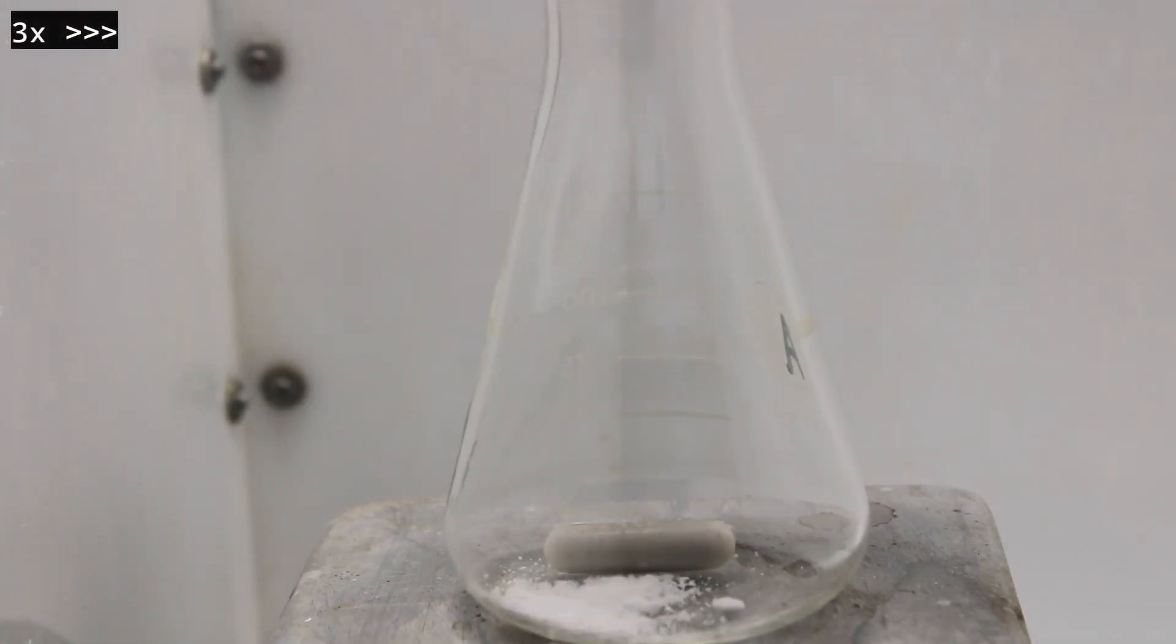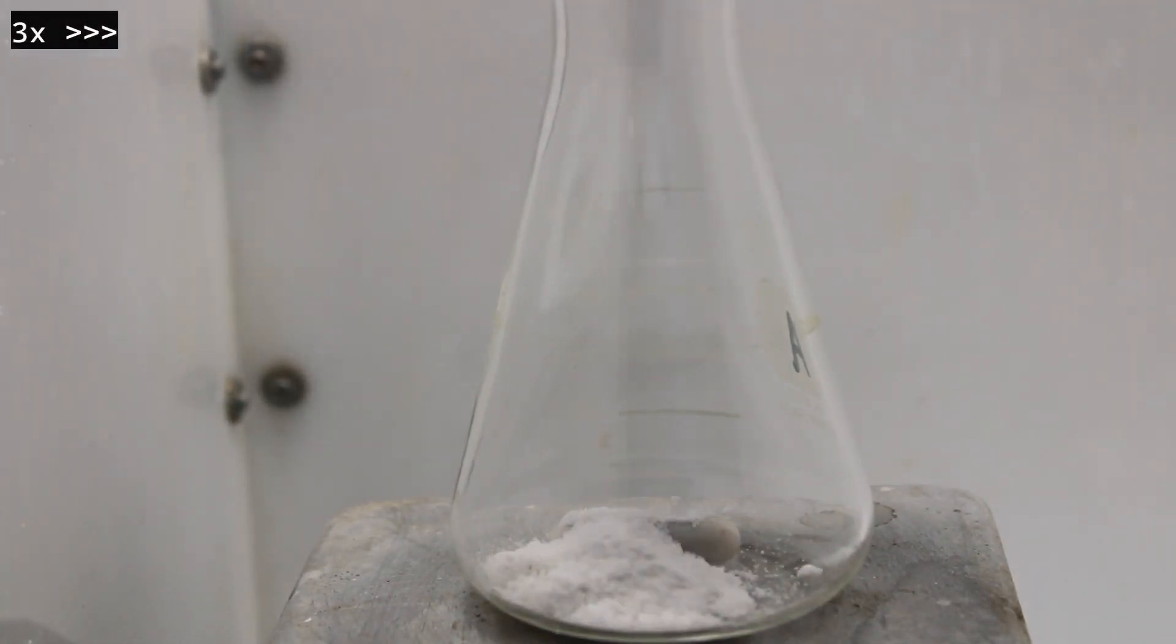Then, 8 grams of potassium cyanate were dissolved in 20 milliliters of hot distilled water. The mixture was stirred and heated until everything dissolved.